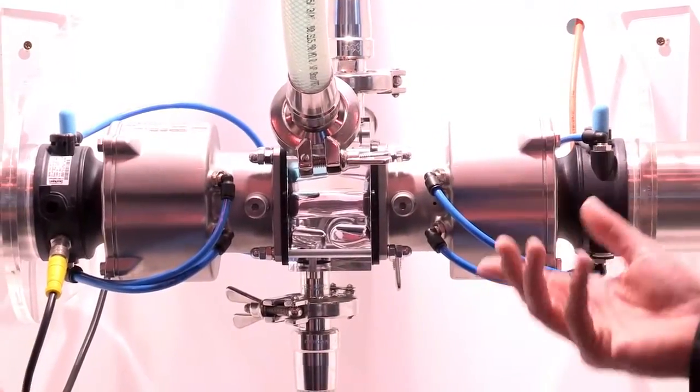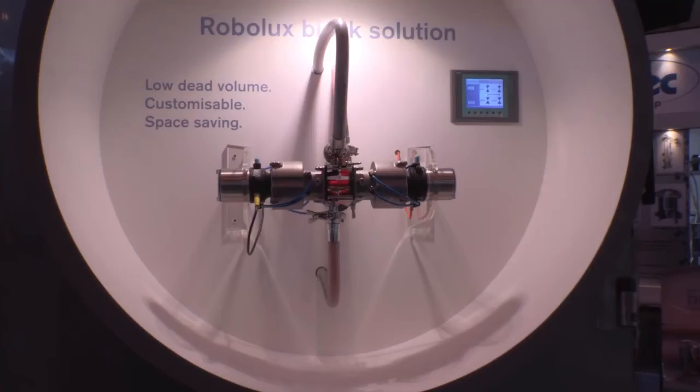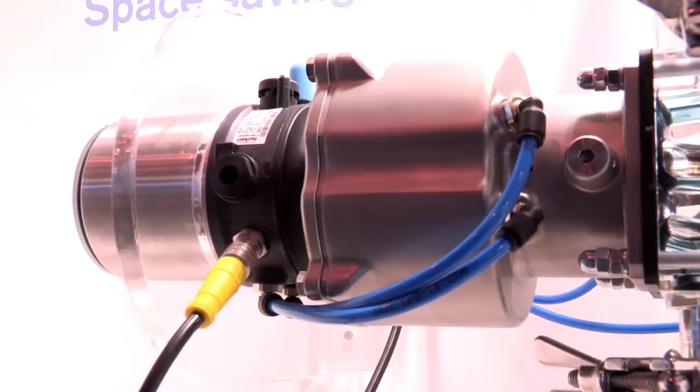The double seats Robolux provides minimum dead space in a block solution. It does not only bring the advantage that you have less internal space, so you don't have that much waste on your products. The products we are using in these types of installations are quite expensive.